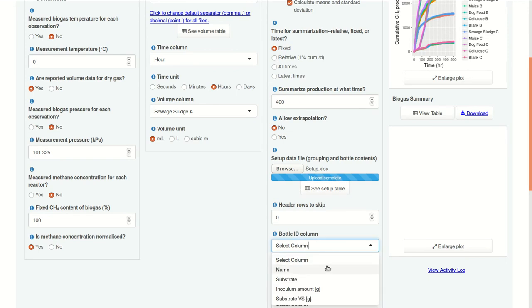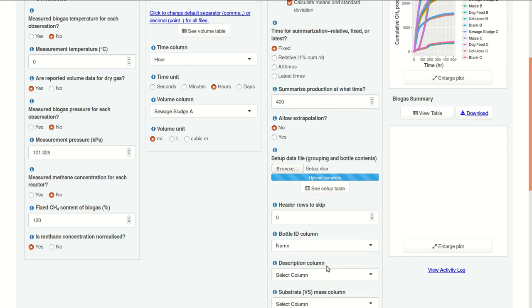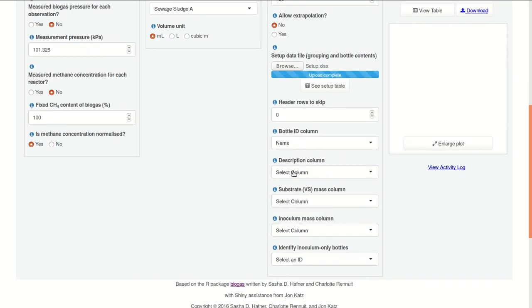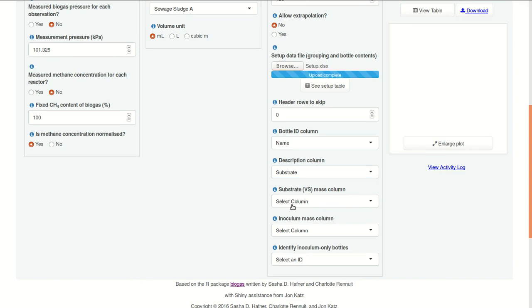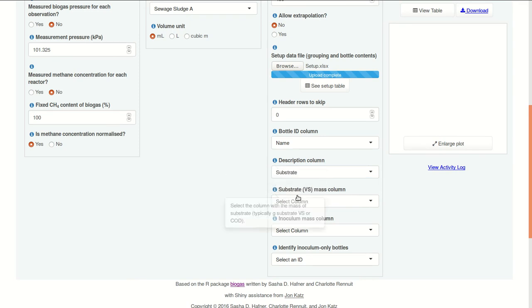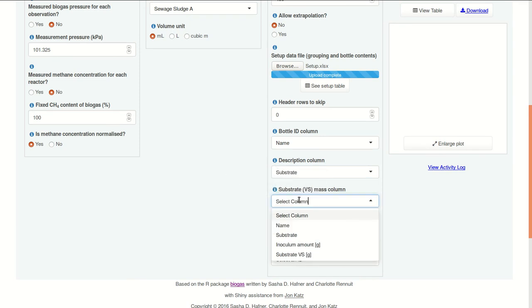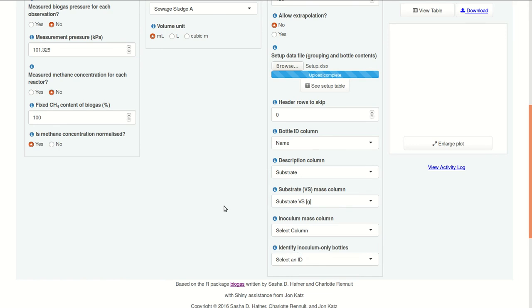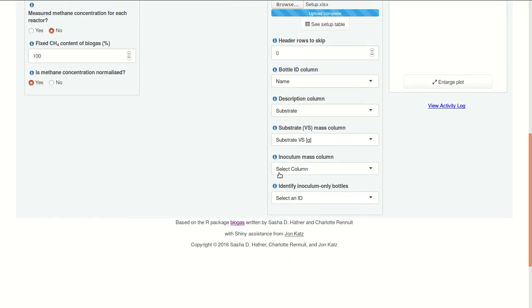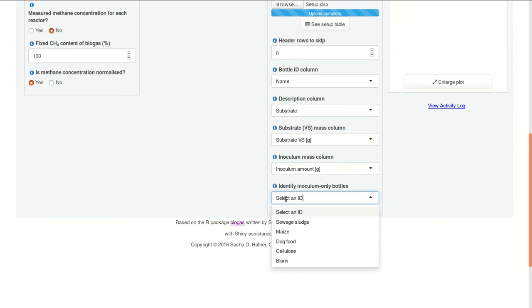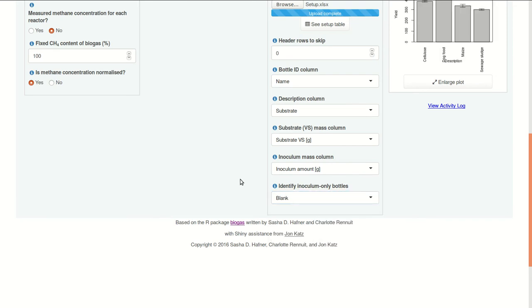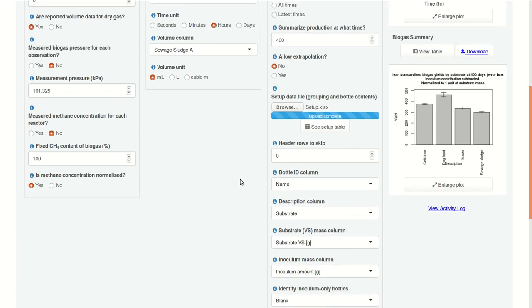Bottle ID. Remember, this is the column that's going to match up. It's going to contain values that match the column names in our biogas file. Description. It's substrate. This is used for grouping. Substrate VS mass. Inoculum quantity. And inoculum-only bottles are called blanks here.